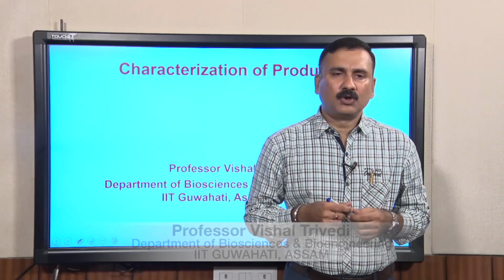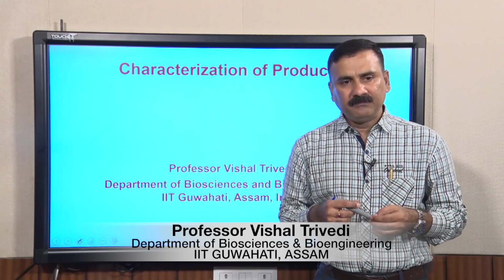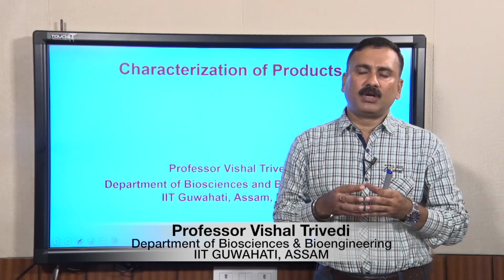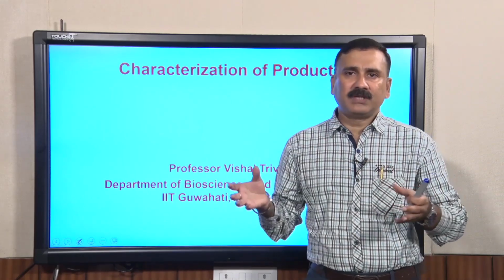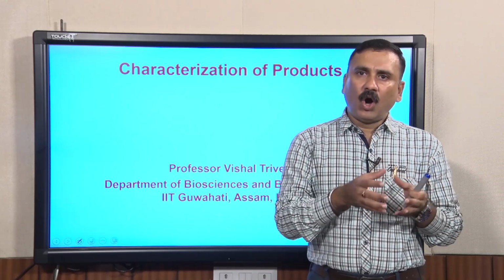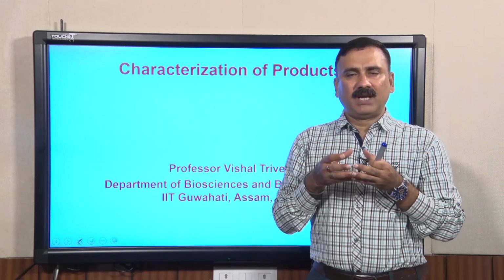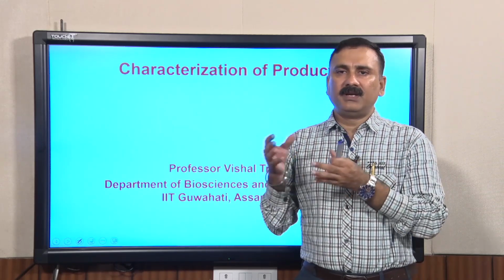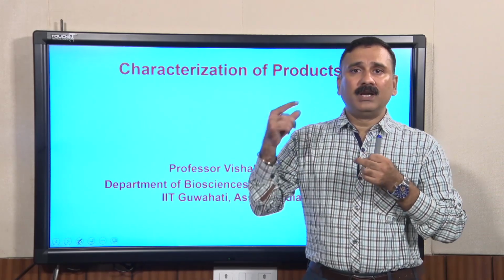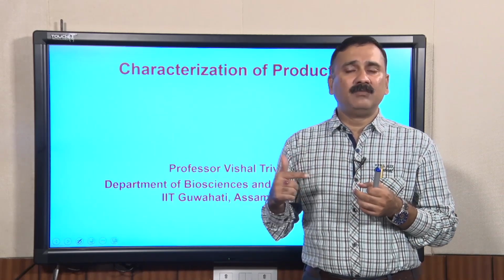Hello everybody, this is Dr. Vishal Trivedi from the Department of Biosciences and Bioengineering, IIT Guwahati. What we were discussing was the characterization of the product that you get from the host, either macromolecules such as DNA or protein, or small molecules such as different types of metabolic byproducts or secondary metabolites which you produce by overexpressing or modulating the environmental conditions or optimizing the production of secondary metabolites.